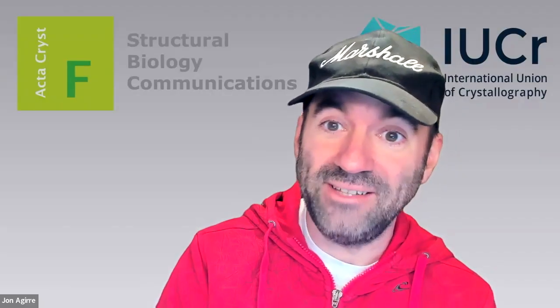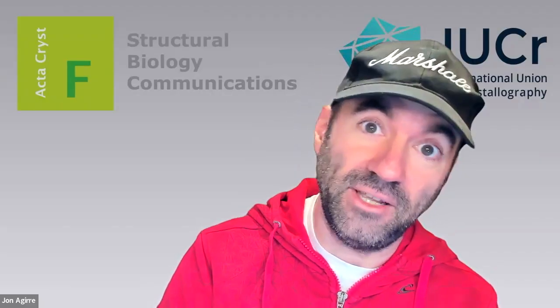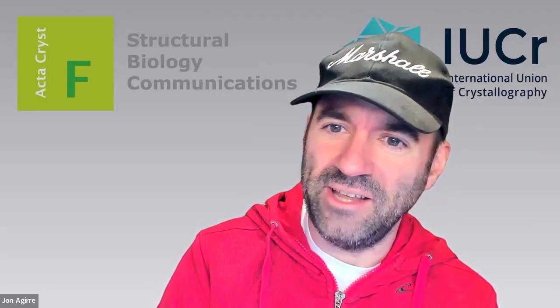Absolutely. Thank you. This is actually a very validation kind of question. Unexpected features in the data, in this case images, but also metadata, are most often wrong. Sometimes they might be right and even very interesting. Could automated procedures like CryoSift have an inherent risk of suppressing these unexpected but interesting features? And if so, how might you prevent it?